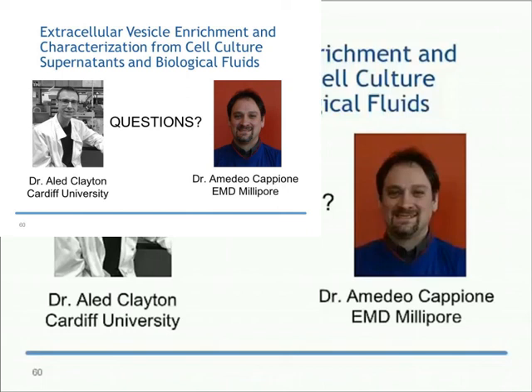It depends really on the application. If you had an RNA extraction and a PCR-based readout, you may well be able to get away with slightly less because of the PCR amplification that you're using to your advantage. But for protein-based studies, based on either antibodies or mass spec, we do seem to require at least 1 mL or so of plasma to get enough vesicles to play with.